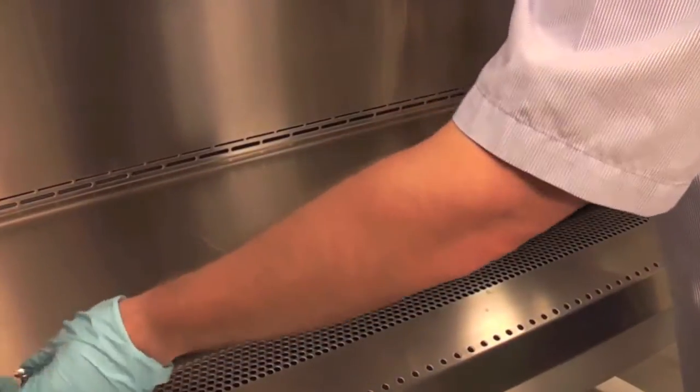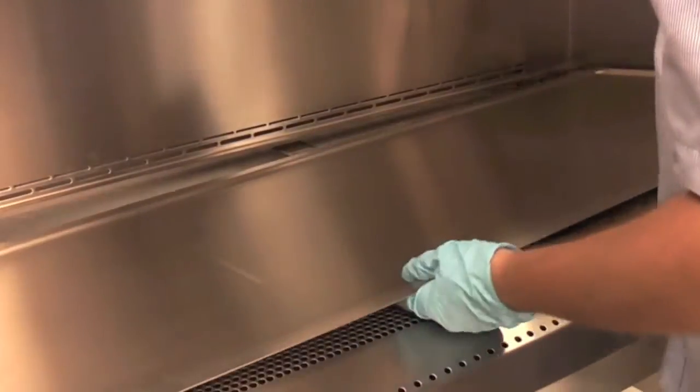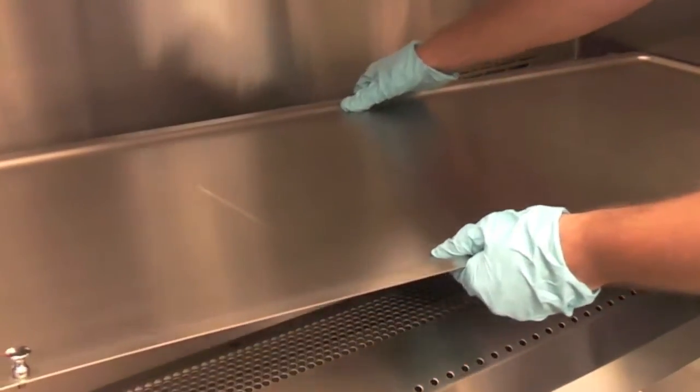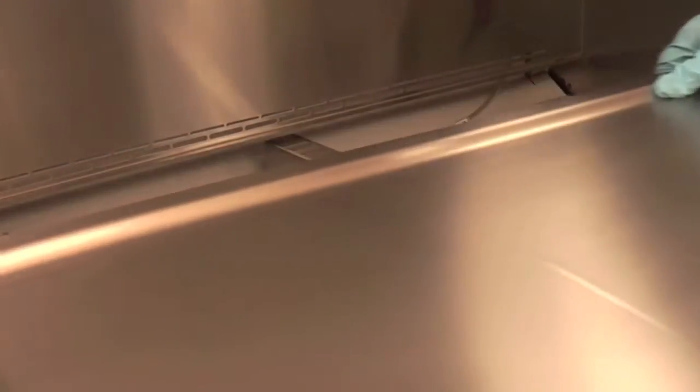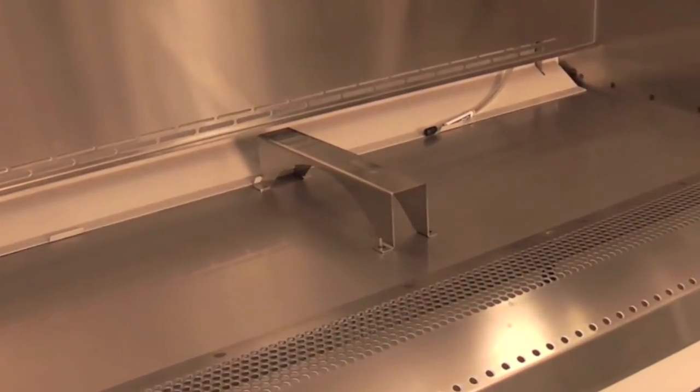First, remove the stainless steel work surface with the knob handles at each end. Lift and pull towards you. Then, lift and remove the support rail that holds the towel catch in place. Do not remove it from the cabinet's interior.